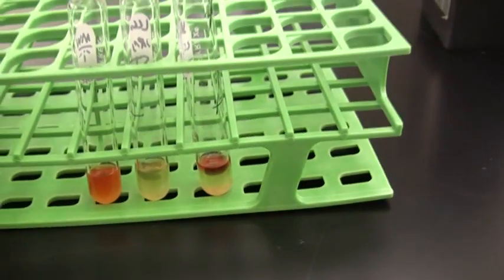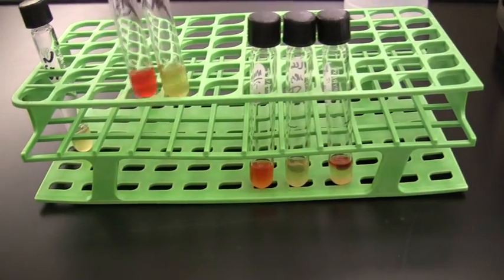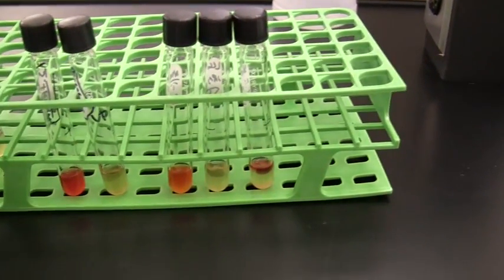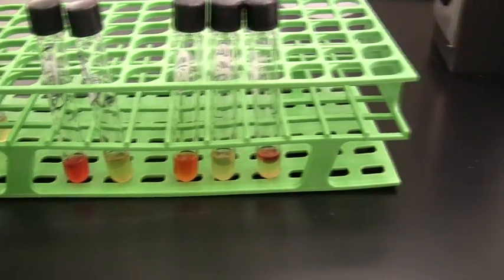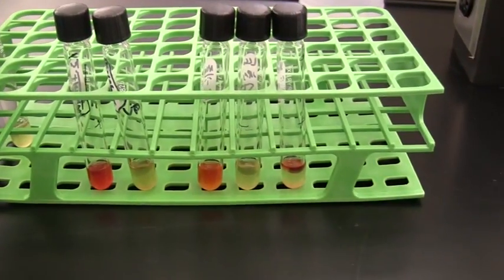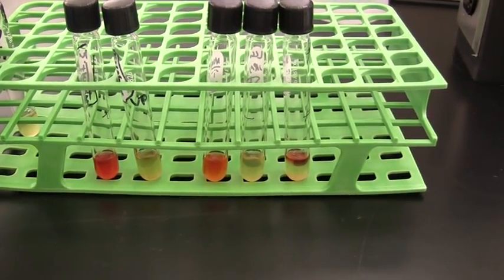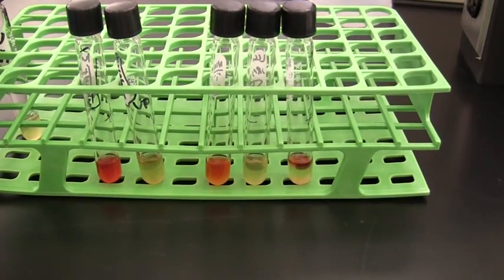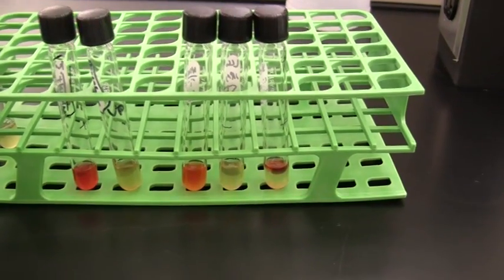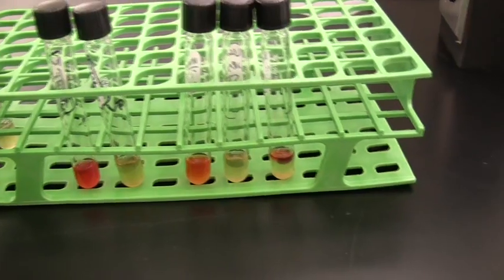So this gives, again, an overview of the MR-VP test, which covers the type of end products that are produced at the end of glucose fermentation. You're either looking for acidic end products or neutral end products, and I say neutral, it can be slightly basic. And you're doing that by adding methyl red to one tube to pick up any acidic products that might be there, and then in the other tube with the same bacterium, adding the VP reagents to pick up a rise in pH. And that is the overview of the MR-VP test.